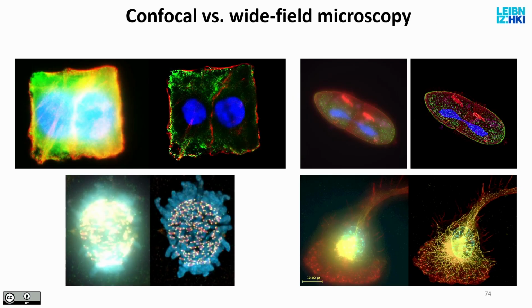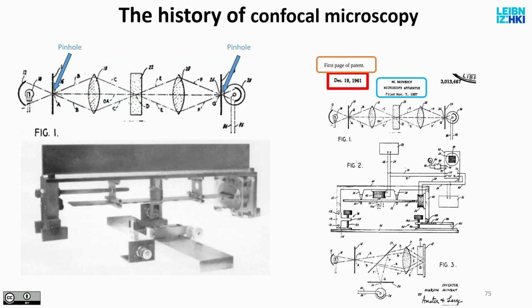And this is just a few comparisons of wide field on the left and confocal on the right, to show you the increased details because of the axial slicing, not because of the lateral resolution improvement.